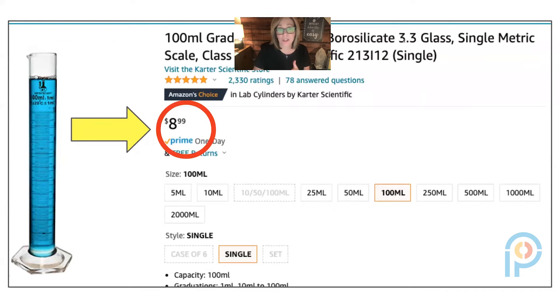The first thing I decided to purchase was this graduated cylinder. It's glass, it goes up to 100 milliliters, you can use it to measure liquids, and you can use it to show the displacement method when studying density. It was only $8.99 — total deal.